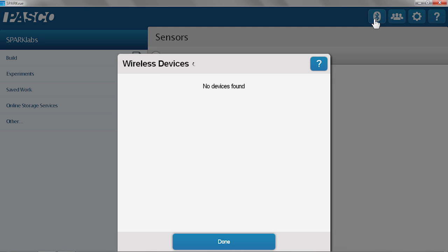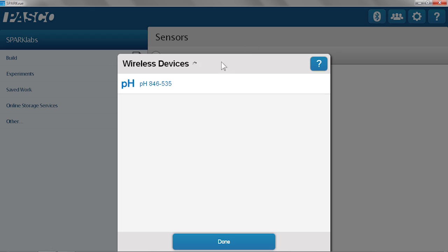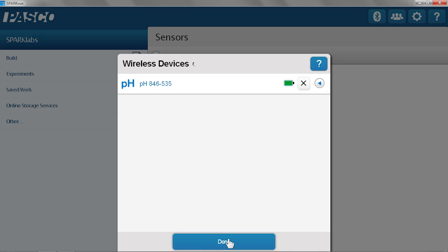So now that he's powered it up, I'm going to go into the SparkView software. I'm going to hit the Bluetooth icon. This is in-app pairing because it is a Bluetooth low-energy device. My device is already found. It has the right ID number. So I'm going to select that device, and it is indicating that it's connected. I notice that it's starting to blink green, meaning that it's seen the computer. I'm going to hit Done.